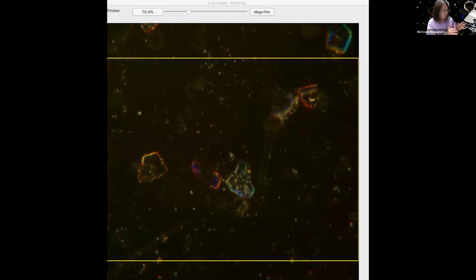So this microscope looks like it's set up pretty well for dispersion staining. So that's on my nice factory installed dispersion staining objective. So what I'd like to do now is go over how we would make a dispersion staining objective. So let me switch back over here.